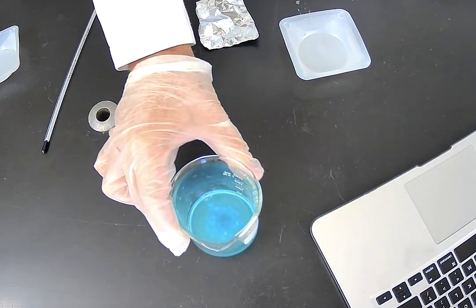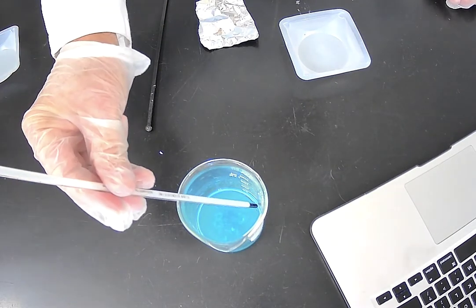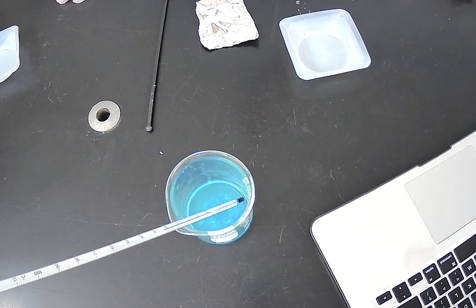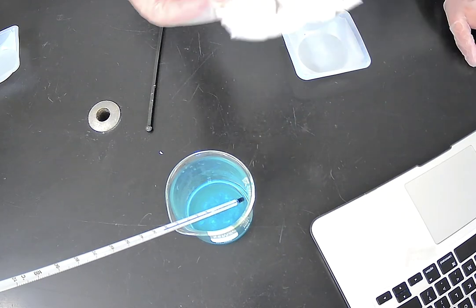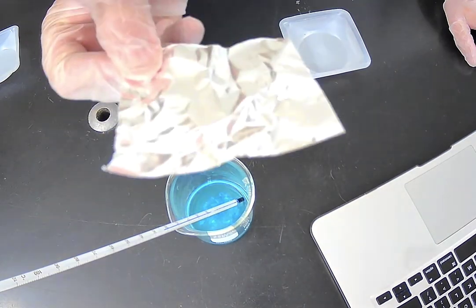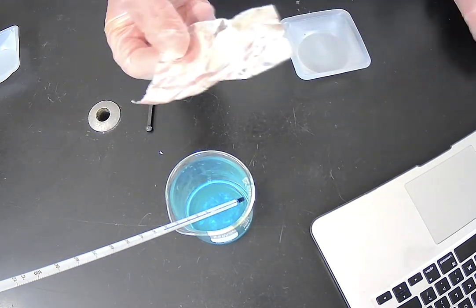So now I am going to use a thermometer to record my initial temperature here. I'm going to make sure that thermometer doesn't tip over. I'm going to try to avoid that as best I can. And I'm going to record the temperature of the solution before I add my aluminum foil. Okay, and this is the idea today. We want to see what's going to happen when we add this aluminum foil to this solution. Is it a chemical change? Is it a physical change? Is there no change at all?